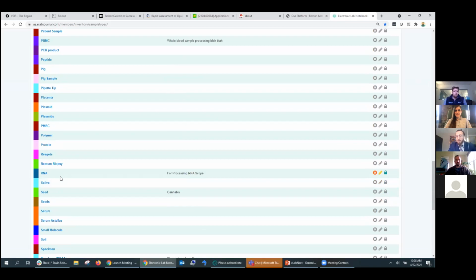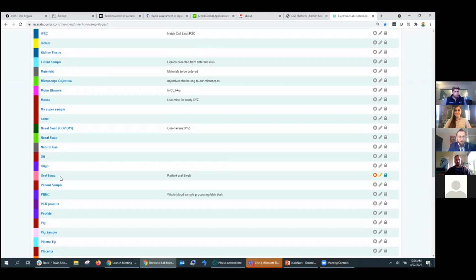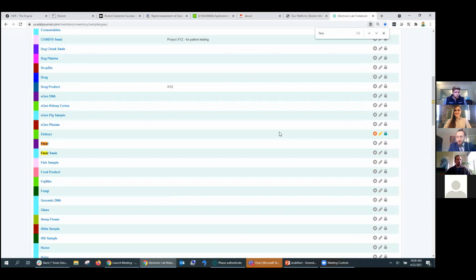And I was looking at BioBot at Engine, and that one seemed a fun one to do. So I've created a fecal swab as an option. For those that don't know, BioBot is doing sewer testing. They take samples from sewers, and they're able to track and trace the epidemiology in the region for COVID, for example, or opioids in that region. With the amazing work that they're doing. So let's say that's the sample that we are working with.